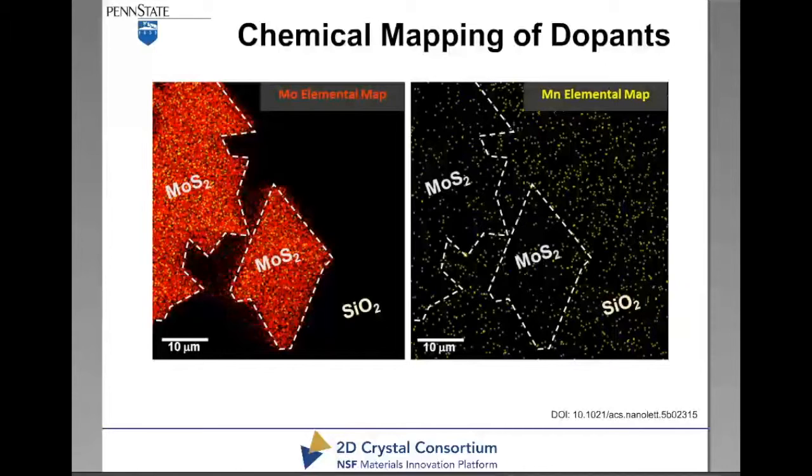Does TOF-SIMS give oxidation state of the constituent atoms? Resolution of TOF-SIMS at PSU, and is it at a user facility? Okay, so the resolution of the TOF-SIMS is on the order of about 50 nanometers or so. 75 nanometers. And yes, it's at Penn State as part of the user facility. The oxidation states of the constituent atoms, I don't believe that it's going to really show that.